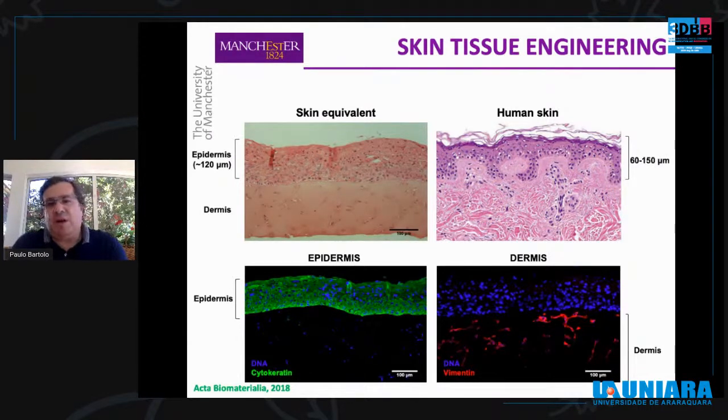melanoma. This means that we need to change again the chemistry, because we are no longer using a UV curing approach. We need to change the photo initiators being used, and we are also changing to a different hydrogel. But also for skin, we are using other technologies rather than additive manufacturing to produce wound dressings.